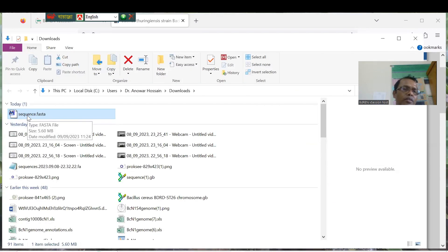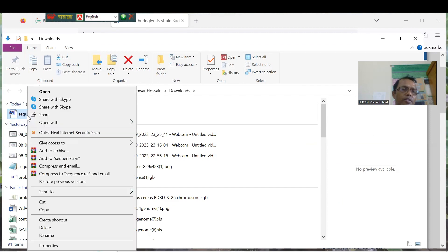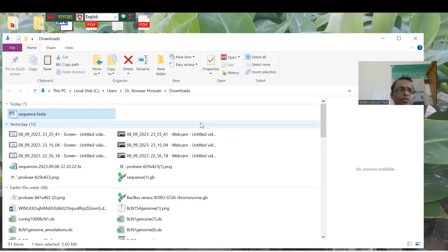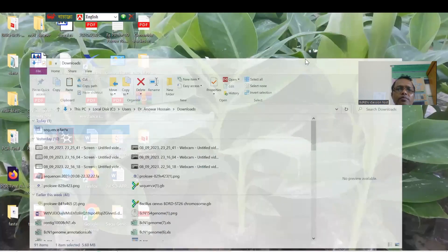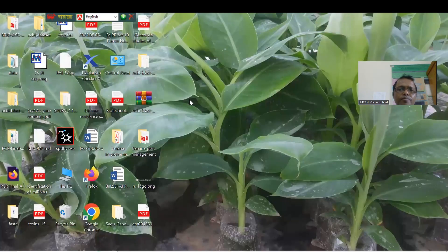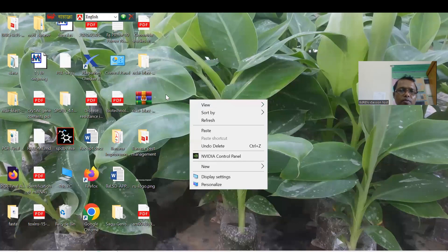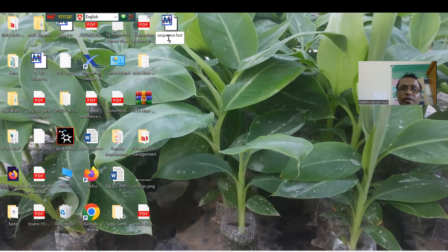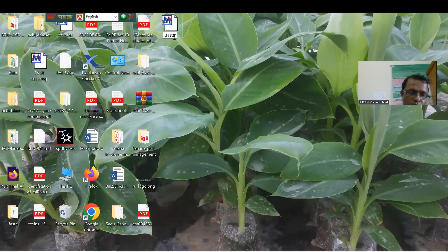Go to your downloads. You can see the downloaded file there. Cut and paste it from the downloads folder to your desktop. You can then rename the file — for example, rename it something like BT.fasta.